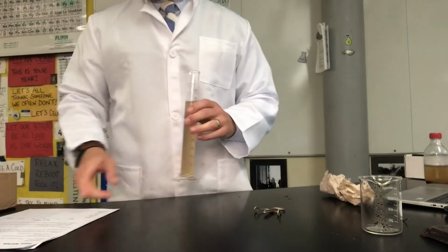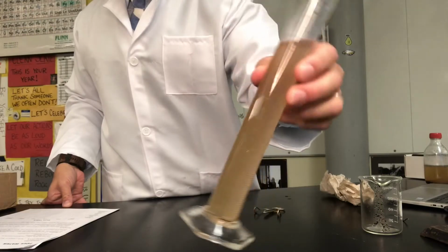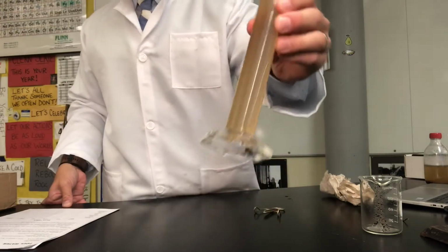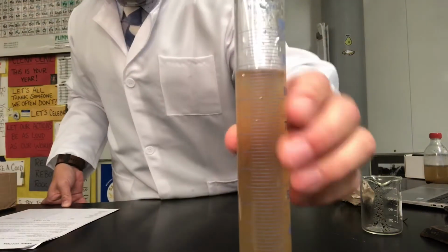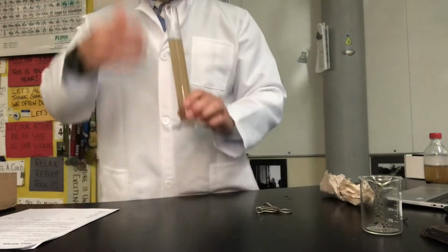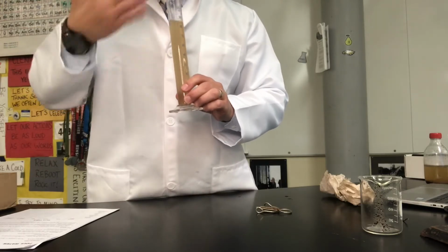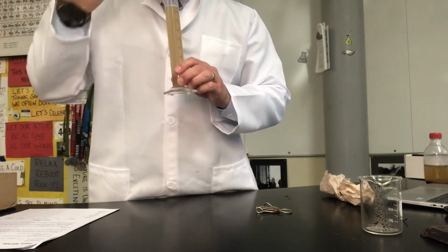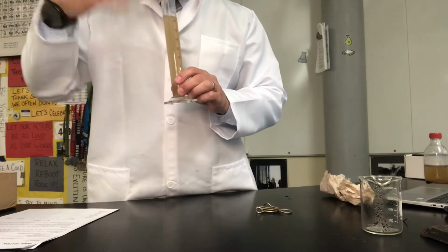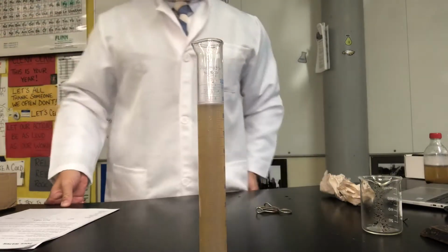There's 89 milliliters left. Now the color looks still about the same, doesn't it? It's still that yellowish, brownish beige color. As far as clarity, it still looks pretty cloudy to me, so nothing has improved with that. Odor-wise, surprisingly, there's actually a lot less odor. It's not as strong. There's still a spicy, garlicky smell to it, but not nearly the smell that it used to have, which is nice.